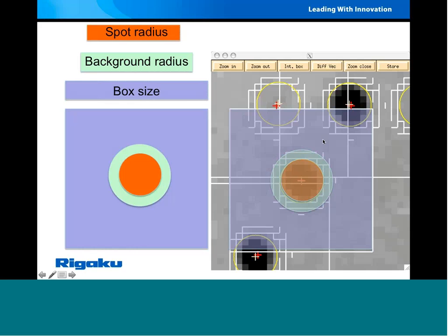The other thing to note here is that once you have this purplish background, I've made it big enough so that I could put 9 of these spots in here. In my opinion, it doesn't have to be much bigger. And notice also that I'm not going further than halfway into, or closer than the center of, the neighboring spots here.